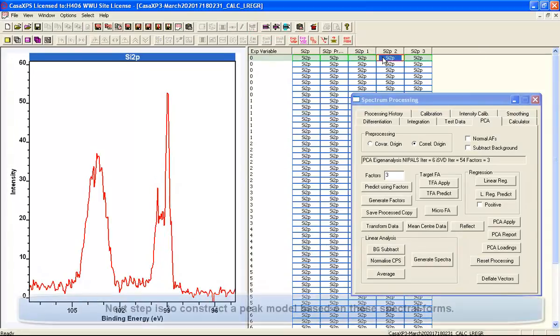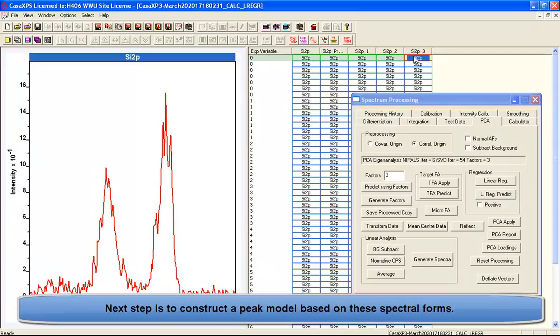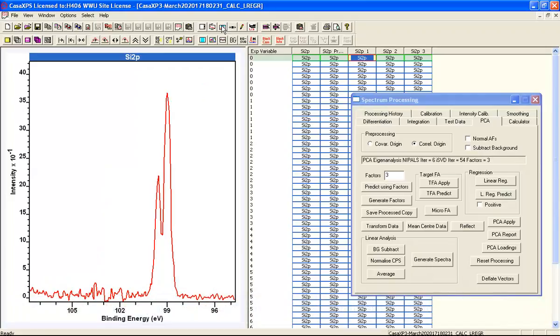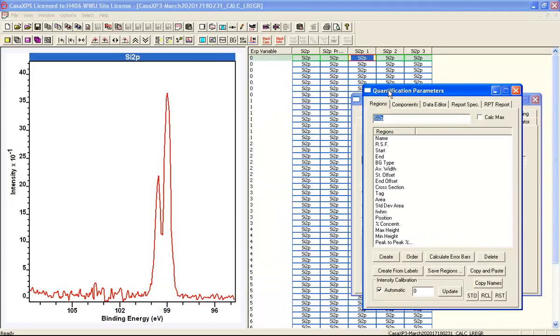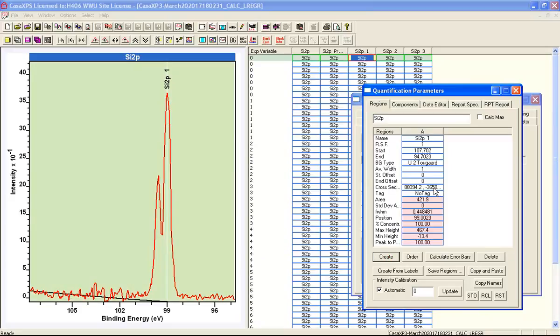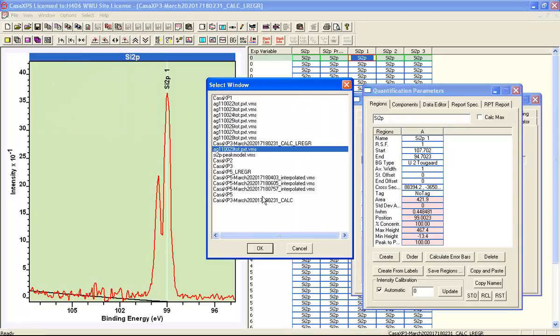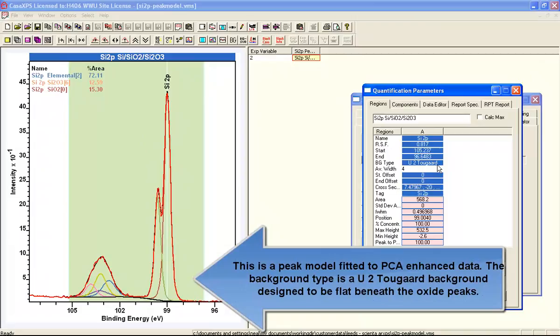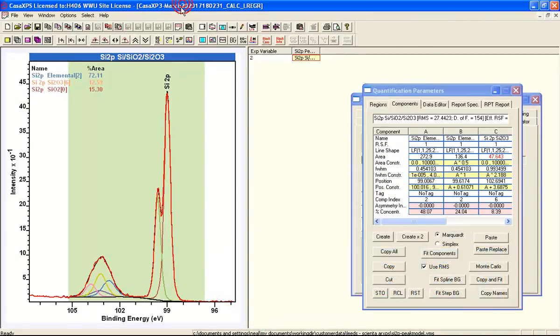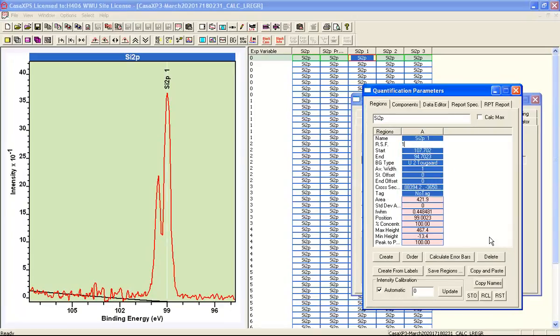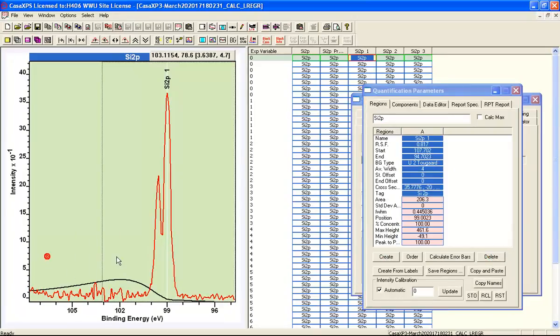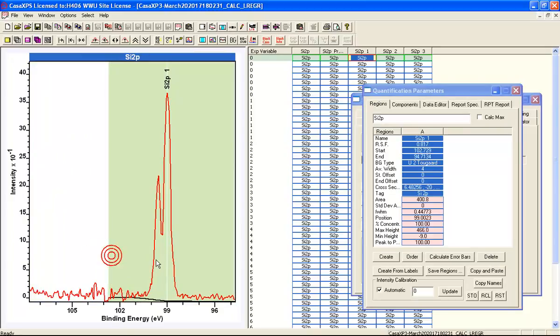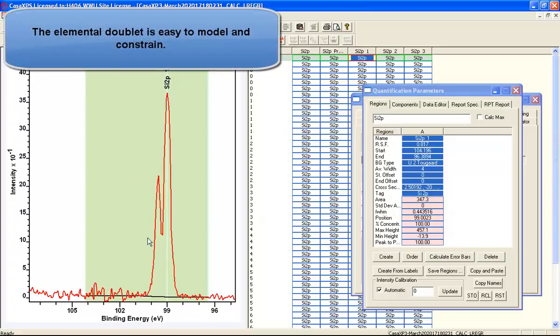The green spectrum is the approximation and the red spectrum is the original data. You can see that the calculated least squares solution is doing rather well. Having obtained a reasonably well-described data set in terms of these three vectors, what we can now do is construct peak models based on the component spectra that we've just calculated. We load the background type from the previously prepared peak model that is appropriate for silicon 2P elemental and oxide data.